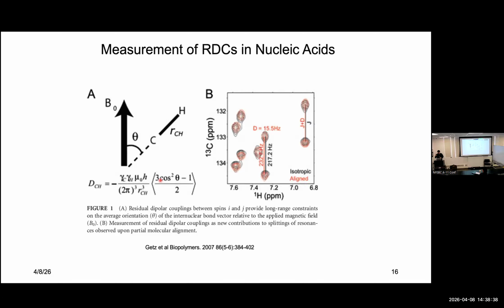It turns out that the aspects of the distribution function that I care about can be reduced into 5 numbers. So the distribution of the alignment of my molecule, despite being complicated, can be reduced into 5 parameters, which define the alignment tensor.